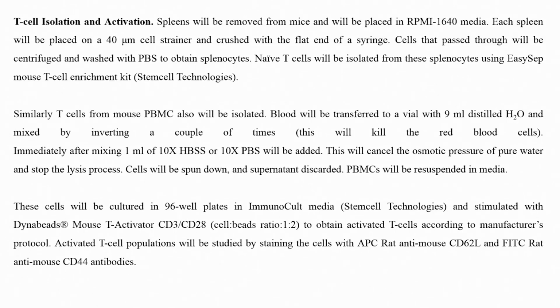Cells that pass will be centrifuged and washed with PBS to obtain splenocytes. From spleen we get splenocytes.